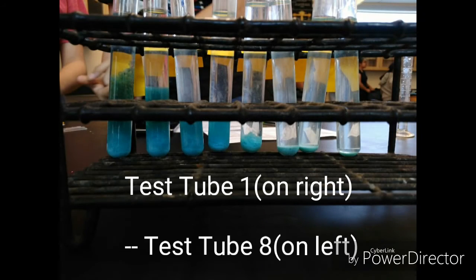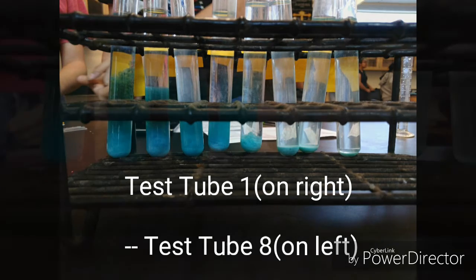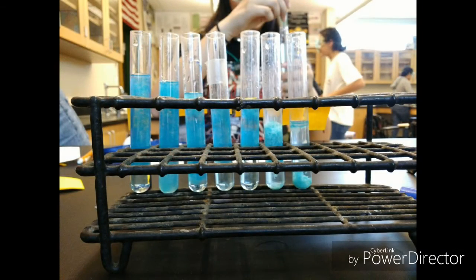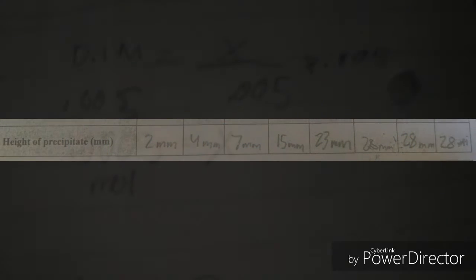We found that the height of the precipitate rose steadily in the first 5 test tubes. The other 3 test tubes measured the same height of precipitate and stayed rather constant instead of continuing the trend of test tubes 1 through 5. Another thing we observed was that in test tubes 1 through 5, there were lighter shades of blue compared to a darker shade of blue in test tubes 6 through 8. Our precipitate measurements are shown here.